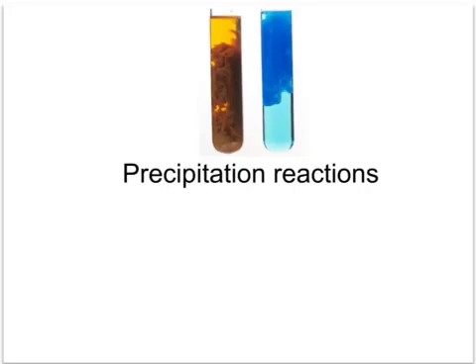This tutorial is all about the reactions we get when sodium hydroxide is added to solutions of transition metal ions. We get precipitates, which are solids made when two solutions are added together, and these have characteristic colours. Here you can see precipitates of iron hydroxide on the left, which is a reddish-brown precipitate, and also that of copper hydroxide, which is a blue precipitate.